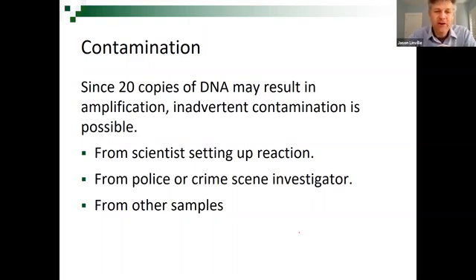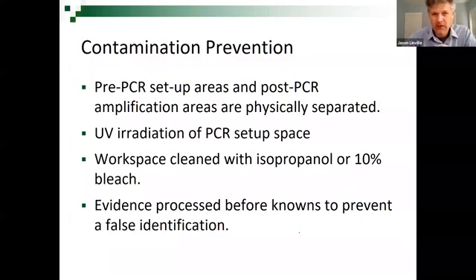All right, finally, how do you prevent this contamination? How do you keep your negative controls negative? Well, as it says here, it could come from the scientists, the police, other people setting up samples. We went over, I think, the difference between mixture and contamination. All mixtures are not necessarily contamination. This is DNA that gets in there after or during the sample collection.